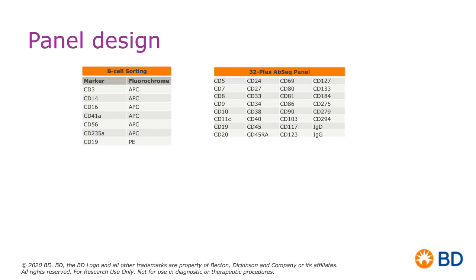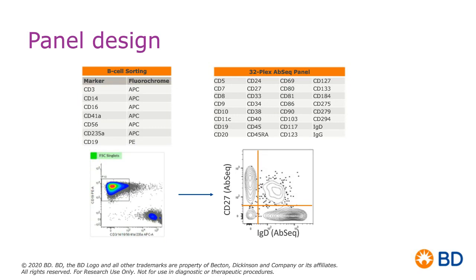Now, what's a reason for cell sorting? Well, as you can imagine, we're interested in CLL and we want to evaluate the differences in these different CLL samples compared to healthy donors. And if we want to really kind of focus our time and money into the cells that we care about, it makes sense to just isolate out the cells that are of the highest value, which for us happen to be the CD19 positive cells.